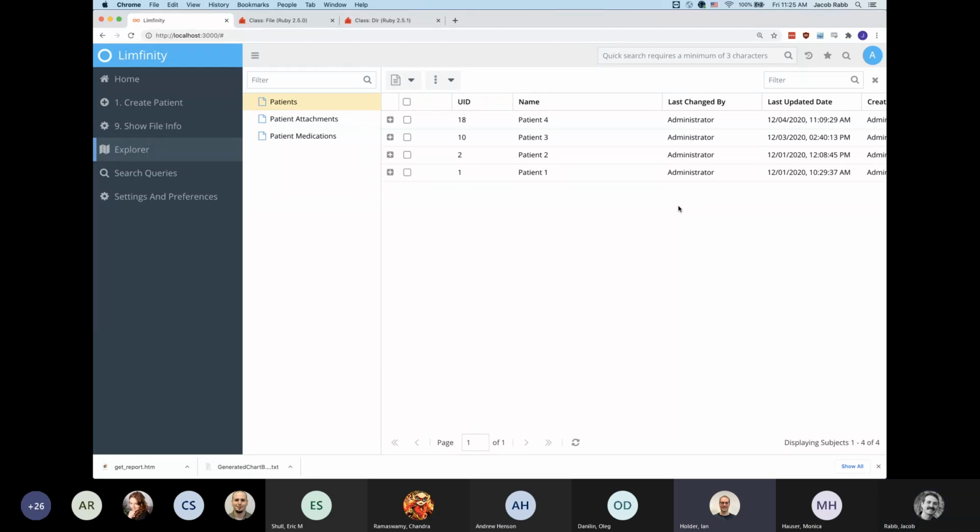This is Ian Holder from GeneWiz, and I'm curious what the steps are to get somebody started with working in Limfinity, because it looks like a really useful platform for us to start using in GeneWiz as well. Yeah, so we have a set of intro videos. I think Monica can probably help you get hooked up with those. Then the question would be, where are you working with Limfinity? How are you setting it up? That's a different question that we probably need to take offline.